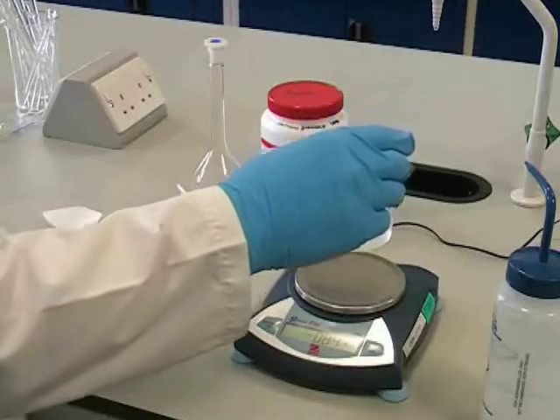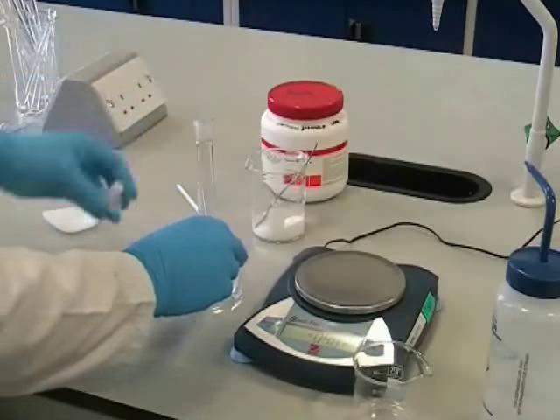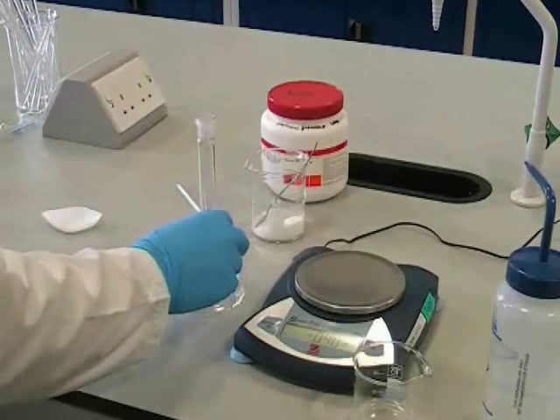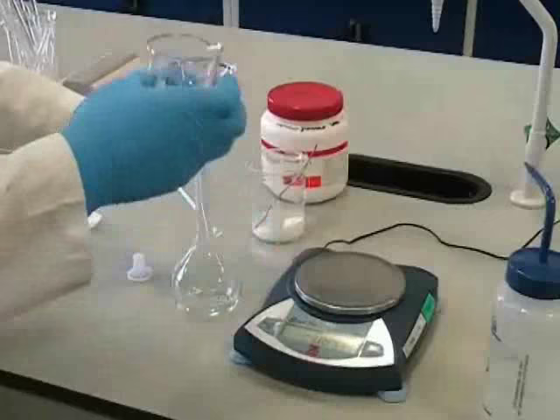And once you're happy that all of the solute has dissolved, you can transfer your solution into a volumetric flask using a glass funnel. Take care not to spill any solution because if you do so, you will have to start the whole process again.